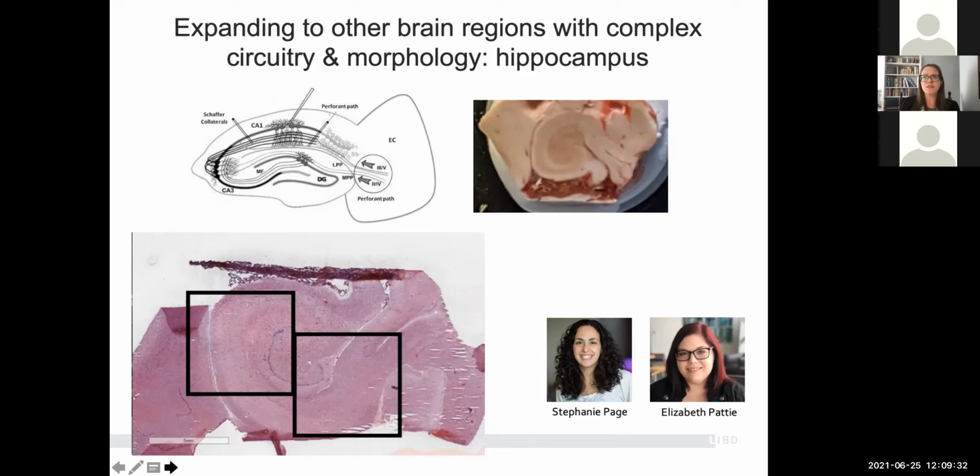An analysis of larger and more anatomically complex brain regions will require additional computational strategies on both the image analysis and the gene expression sides to be able to stitch together multiple arrays and reconstruct these subfields. And you can imagine doing this across different donors with slightly different dissections also poses significant challenges.